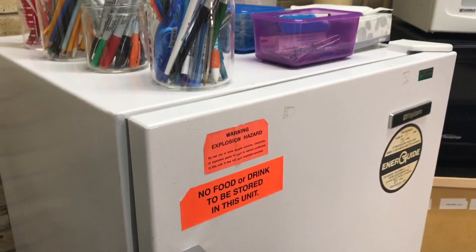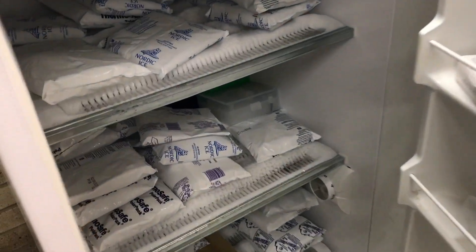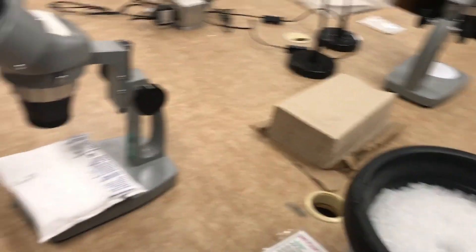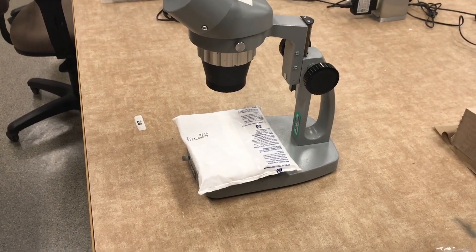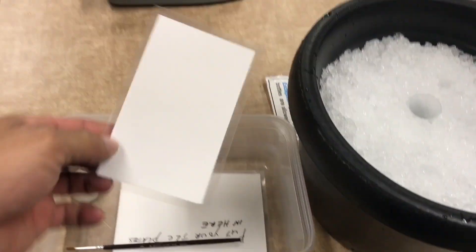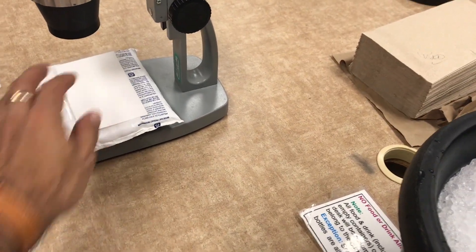For the next step you have to take one of these cold packs that is within the freezer. Take one and put it on top of your stage in the microscope. Then use one of the plastic cards and put it on top of the stage.